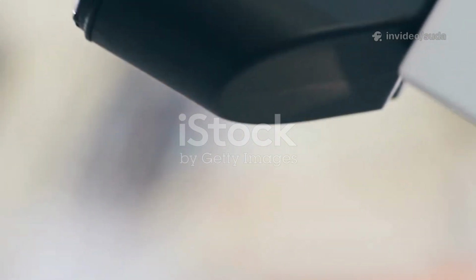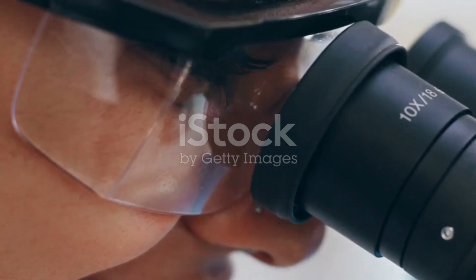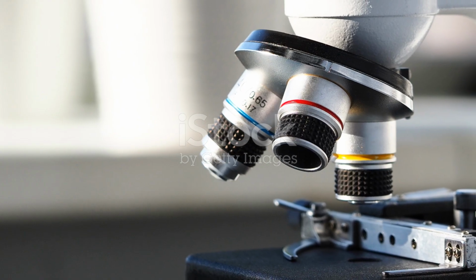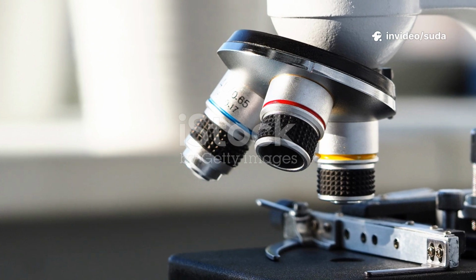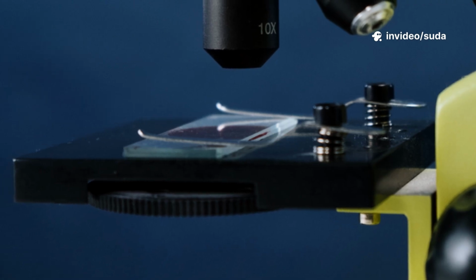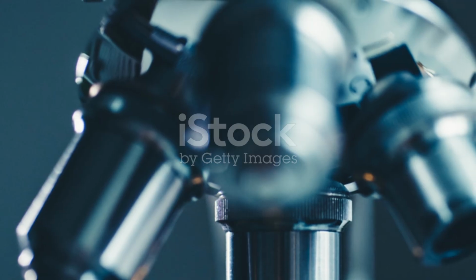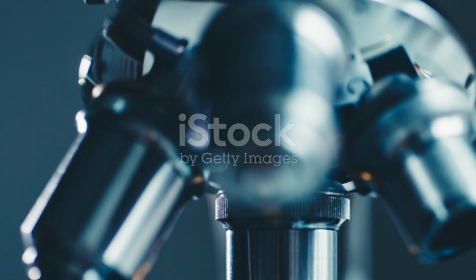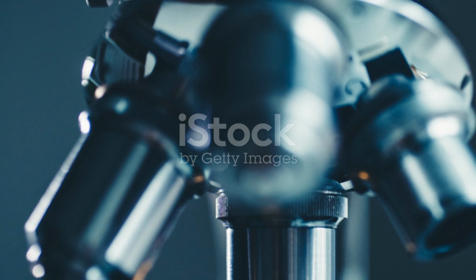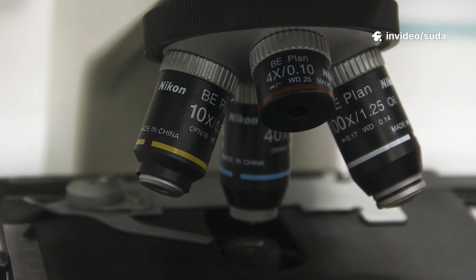At the top is the eyepiece, or ocular lens, usually 10 times magnification. The body tube connects the eyepiece to the lenses below. This is the revolving nosepiece. It holds objective lenses, 4x, 10x, and 40x. Low power is a wide view, like a whole map. High power is extreme detail, like one street. Eyepiece times objective equals total magnification.